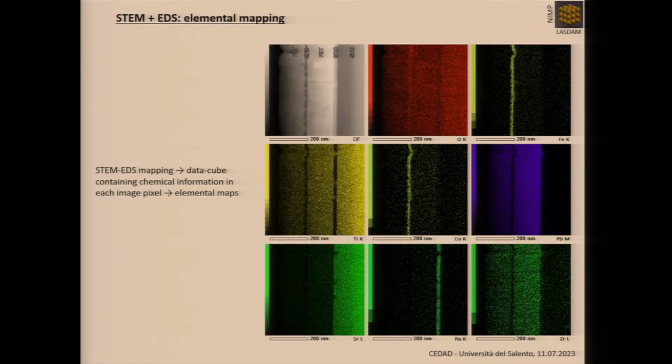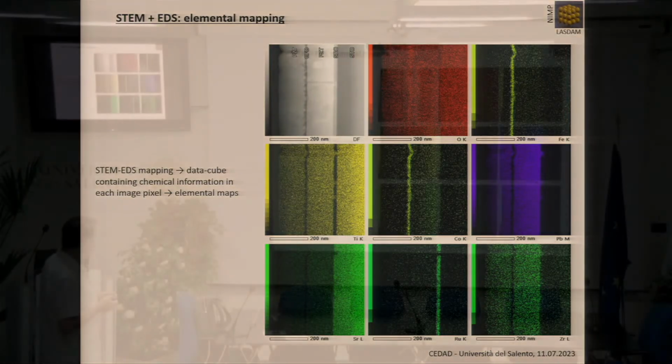We can, of course, couple the analytical technique with some observation with an imaging technique, the STEM, and we can get very local chemical information.